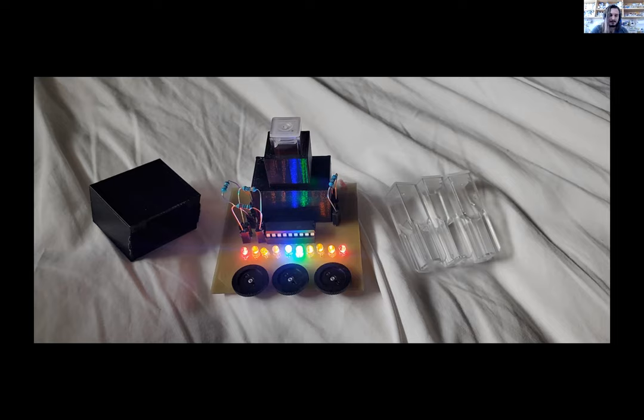The important part of this is to calibrate, because you have no numerical value. And to be fair, spectrometers need to be calibrated against something, because when you see a publication that just says optical density units with no calibration, it actually doesn't mean anything, because every single spectrometer has variations in its reading. From machine to machine, you'll get a different spectrometer reading. Most people calibrate with FACS, cell sorting machines that actually count the cells, and calibrate optical density to cell count. You can use a hemocytometer, or you can simulate the optical density itself.